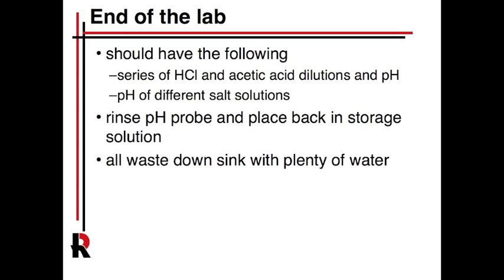Now, there'll be a post-lab where we can talk about sort of how to calculate Ka, for instance, from these readings. Now, the other is you need to rinse the pH probe, and I think they have little bottles you'll be putting them back into. It'll be pretty clear how to do that. And then again, we can put the waste down the sink with a lot of water. And so other than that, it's a pretty straightforward lab.